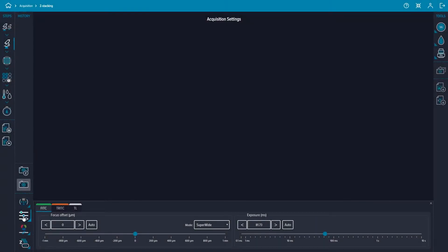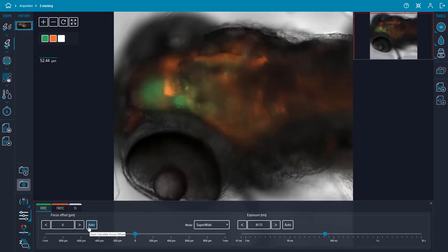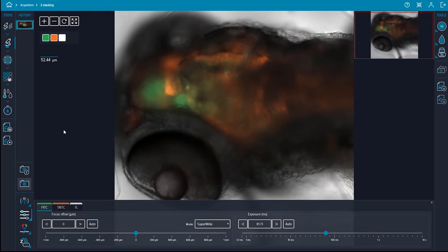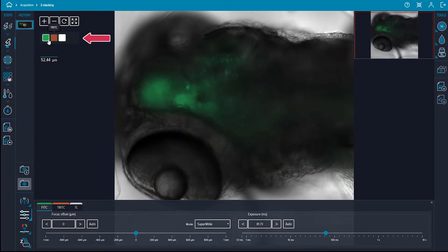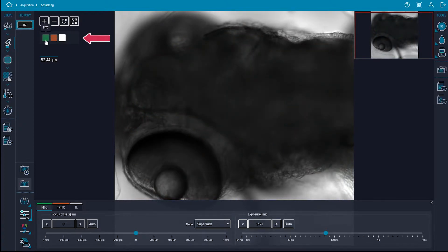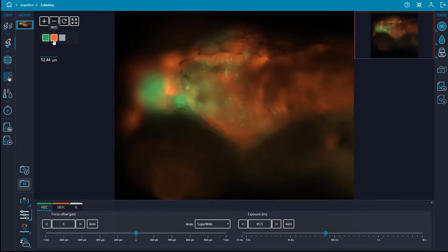First set up focus as normal in the acquisition settings step and snap a preview of your image. To best visualize the single plane image, toggle on and off the available channels in the image viewer. This also aids in optimizing the settings for exposure and focus offset.